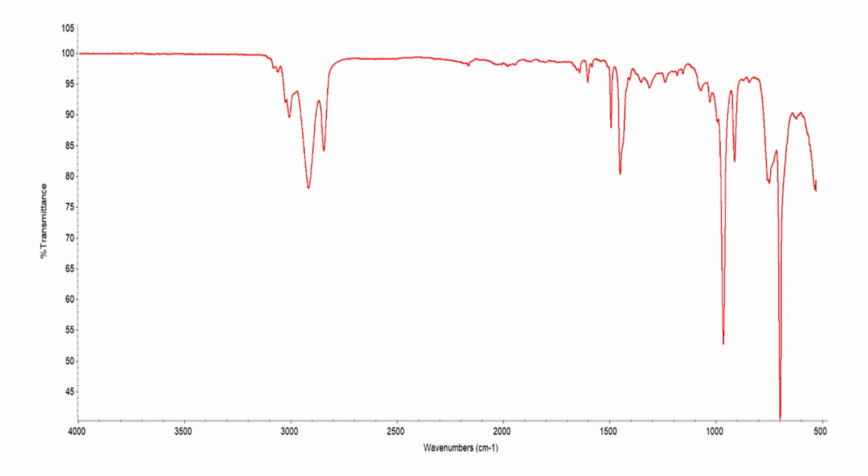Welcome. One of the most popular applications for FTIR analysis is to answer the question, what is it? Well, I had to answer that question earlier this week in the lab. I had an unknown polymer, so I collected an ATR spectrum using the Pike Miracle, and I used a database search to see if I could identify that polymer. So let's take a look at the database search results.